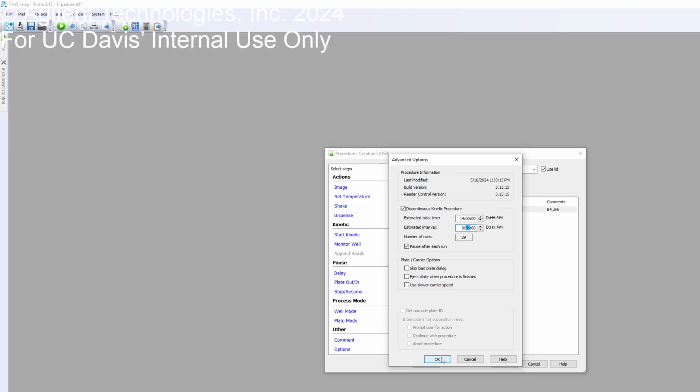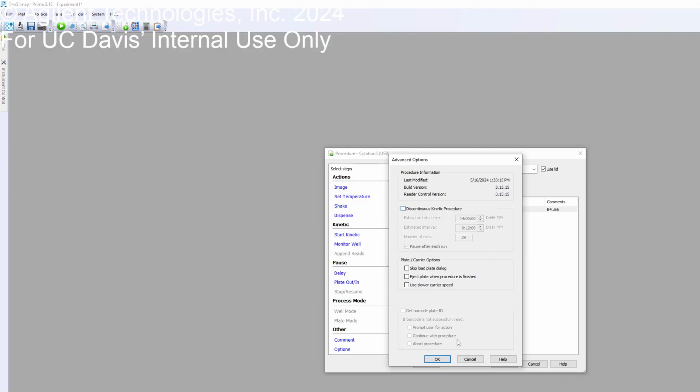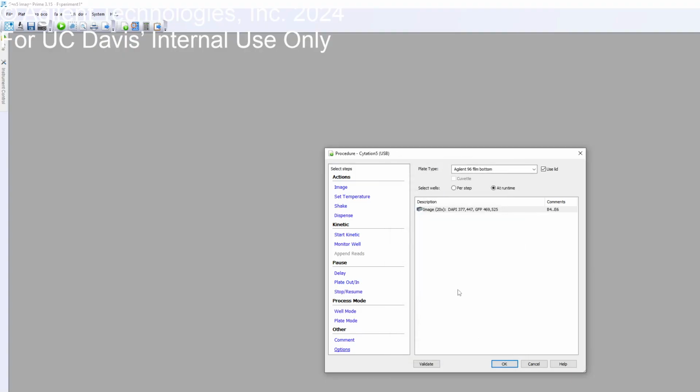Oh, so we don't need to keep the plate inside for 14 days? No. Oh, okay. Yeah. So that's why this mode is designed, so you can actually take the plate away from the instrument and open it up for your colleagues because they're going to need it. Yeah, that's fine. We have a system called a BioTek that can actually move your plate into an incubator through automation. We have an automated incubator, if that's the route you guys go, but the system itself, I wouldn't treat it for 14 days. Any questions?